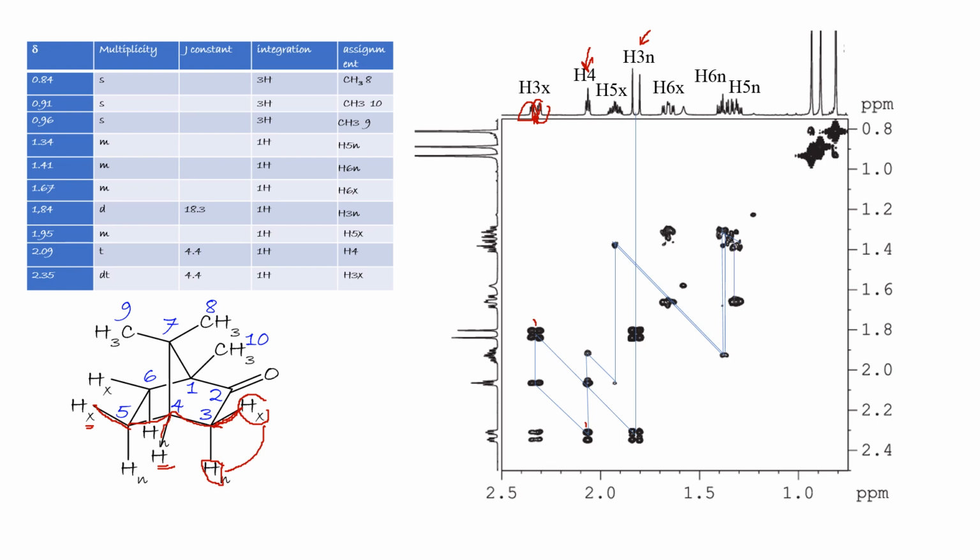All right, and 5N and 6N coupled. H6N and H6X are coupled. It's very complicated in this area. Okay, and we assigned all the protons except the methyls.